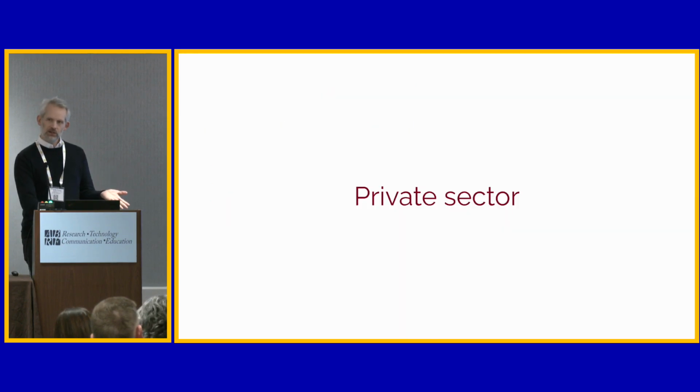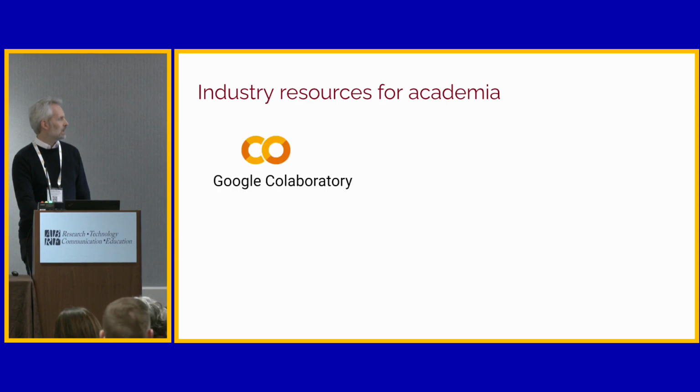You have all of these resources available nationally for scientific research, but the private sector has also invested quite a lot in making resources available. One obvious one, if you're comfortable with Jupyter Notebooks, is Colab, which hosts Jupyter Notebooks for free, and you have access to GPU compute. A lot of the code to train, retrain and fine-tune models usually has a notebook accessible through Colab. So if you just want to test things out or learn about this, it's an excellent way.